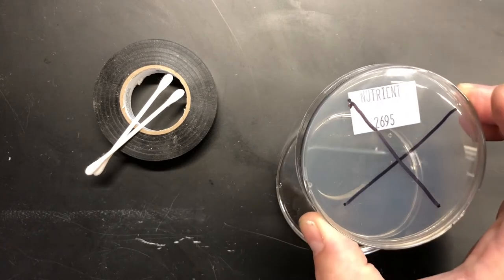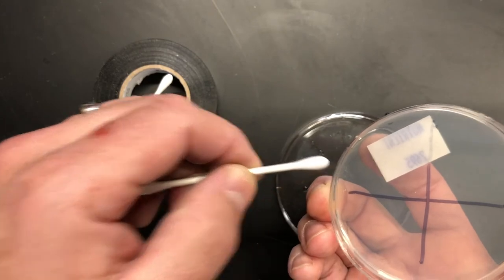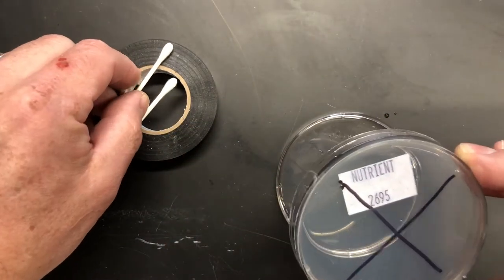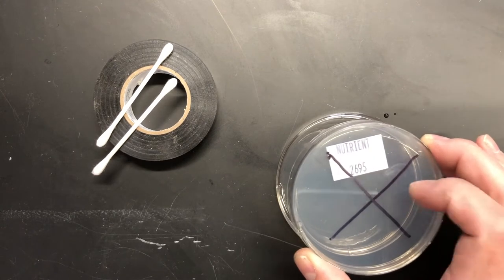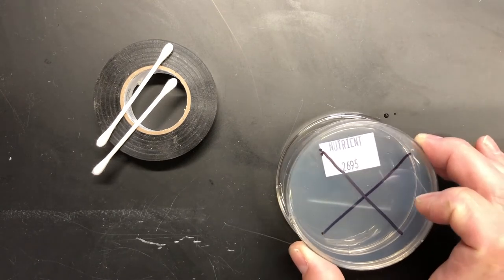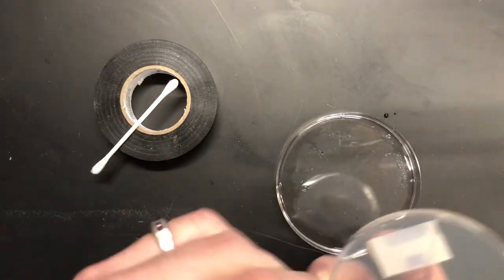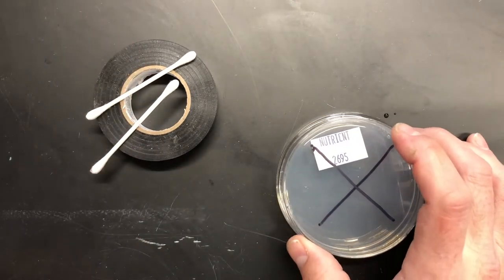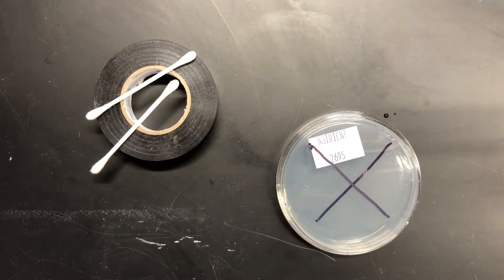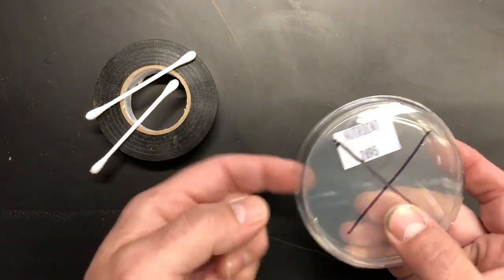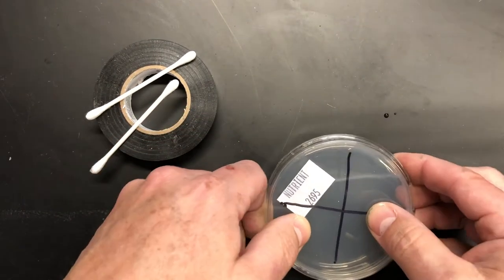This only gets flipped over when you're ready to swab with your q-tip, and then otherwise it stays facing down so that you're protecting your agar as much as possible. Alright, so you've got your quadrant, your student swabs, and then closes it back up. Now this is where a lot of people go wrong. A lot of people will take strips of tape and just tape that closed, and that's not good enough. This needs to be sealed.